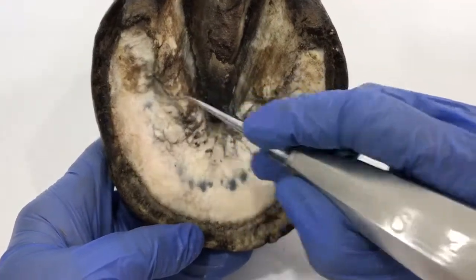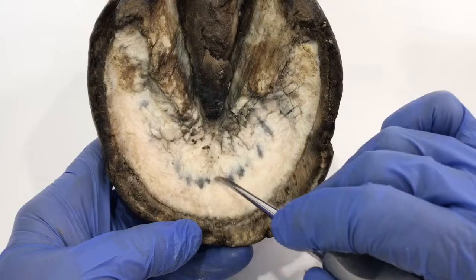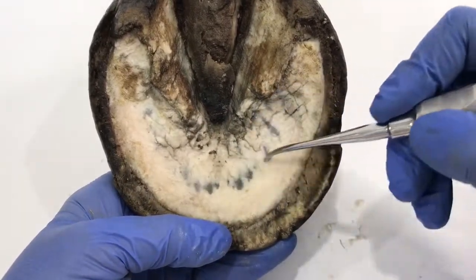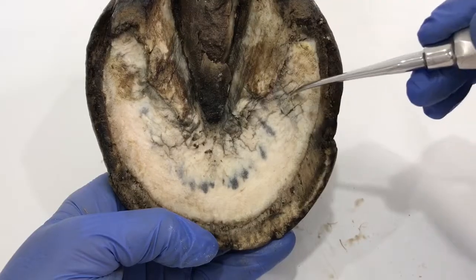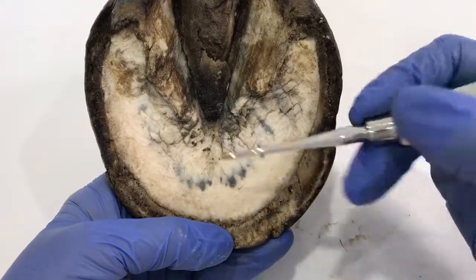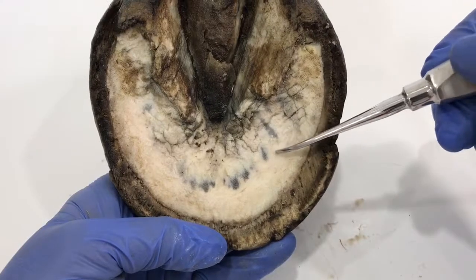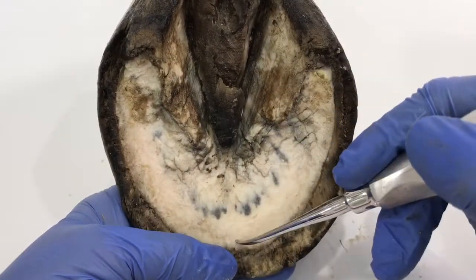An interesting part of the sole — I have exfoliated it and you can see it's quite clean. But look at this area through here which really drew my attention: it looks very similar to the shape of the coffin bone. I think this is a more pathological pigment rather than a random one. We've seen pigment spots on soles of feet before, but this one looks quite symmetrical, and I'm wondering if it has something to do with the coffin bone.